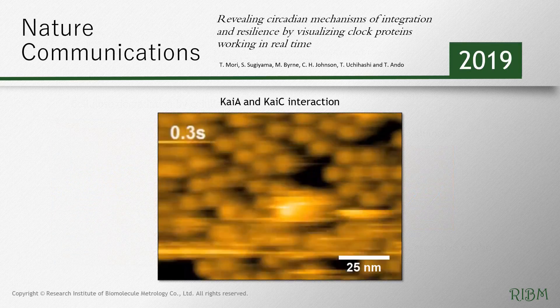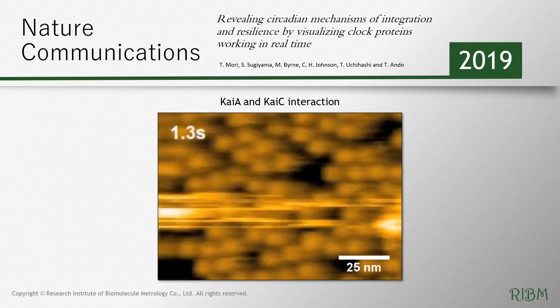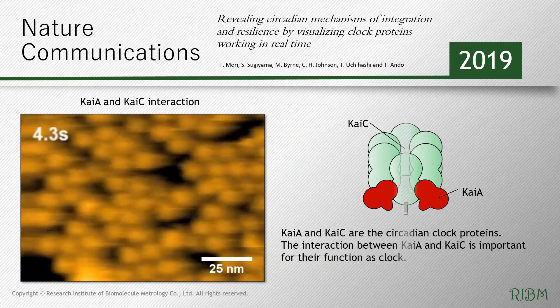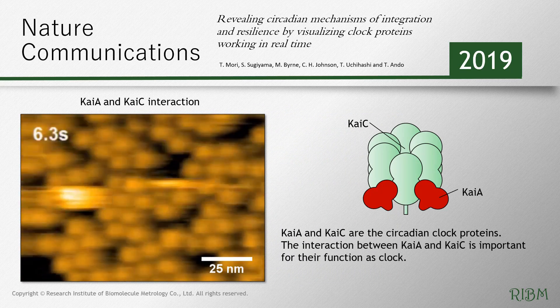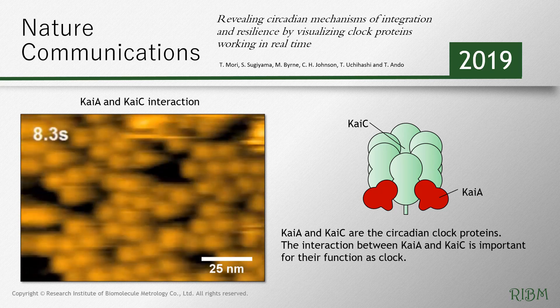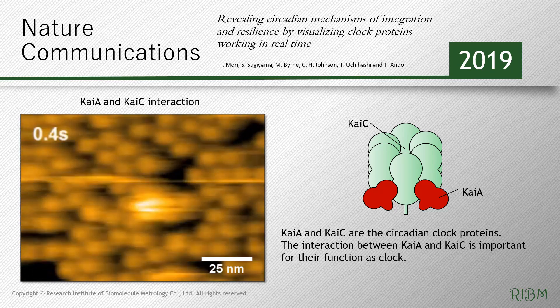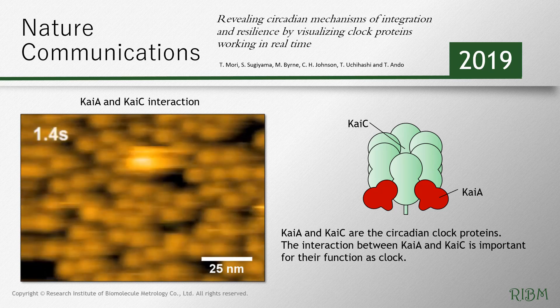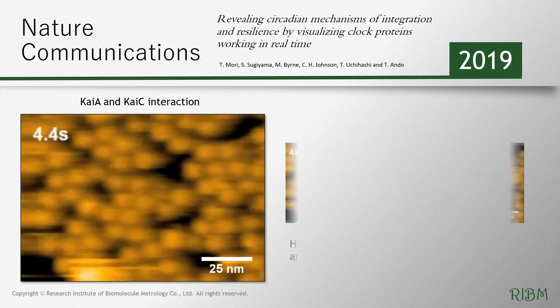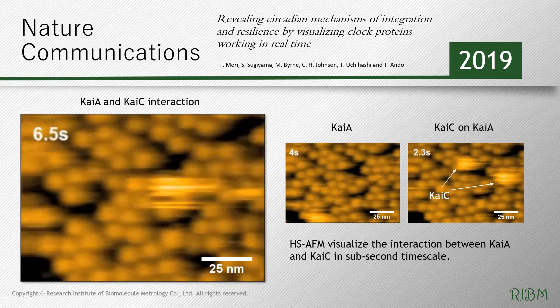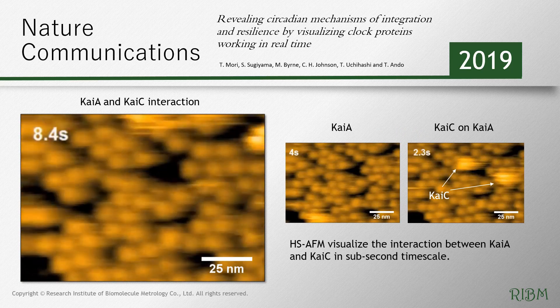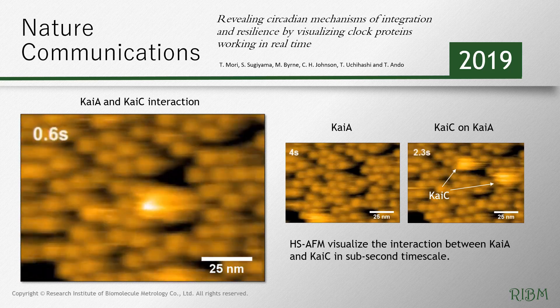The video shows KaiA and KaiC interaction. KaiA and KaiC are circadian clock proteins. The interaction between KaiA and KaiC is important for their function as a clock. High-speed AFM visualizes the interaction between KaiA and KaiC on a sub-second time scale.